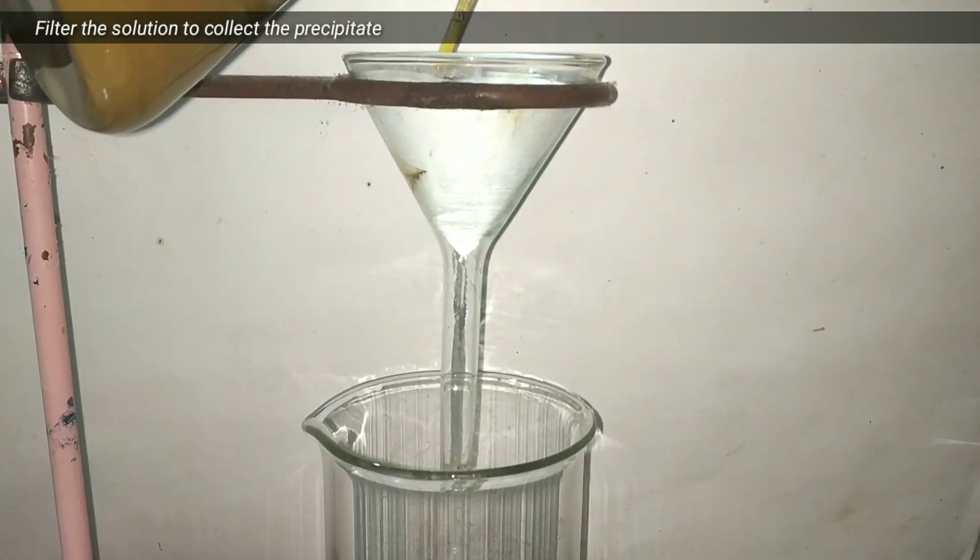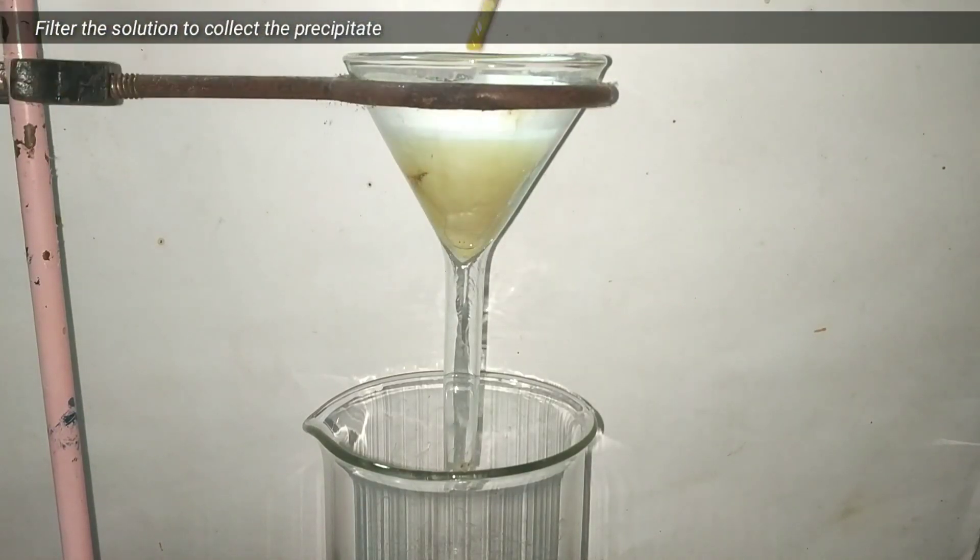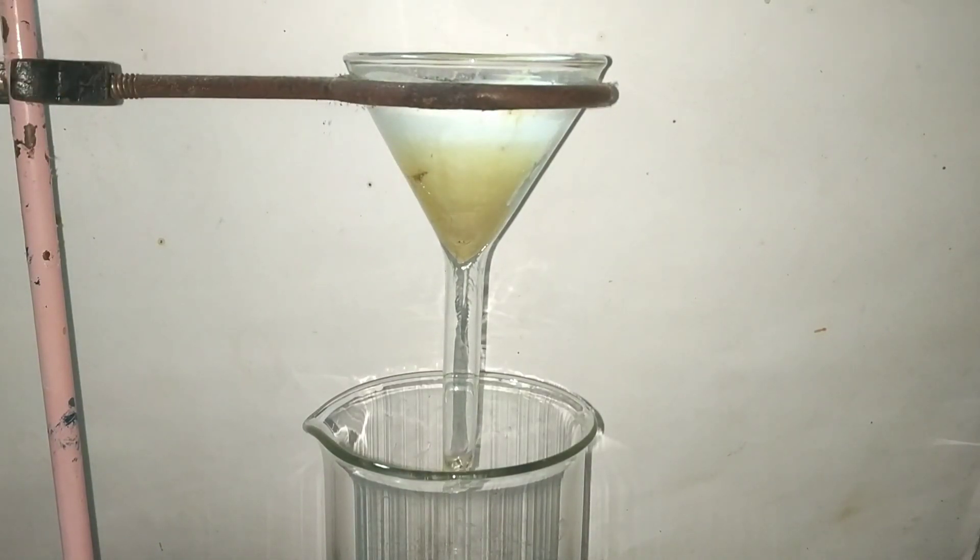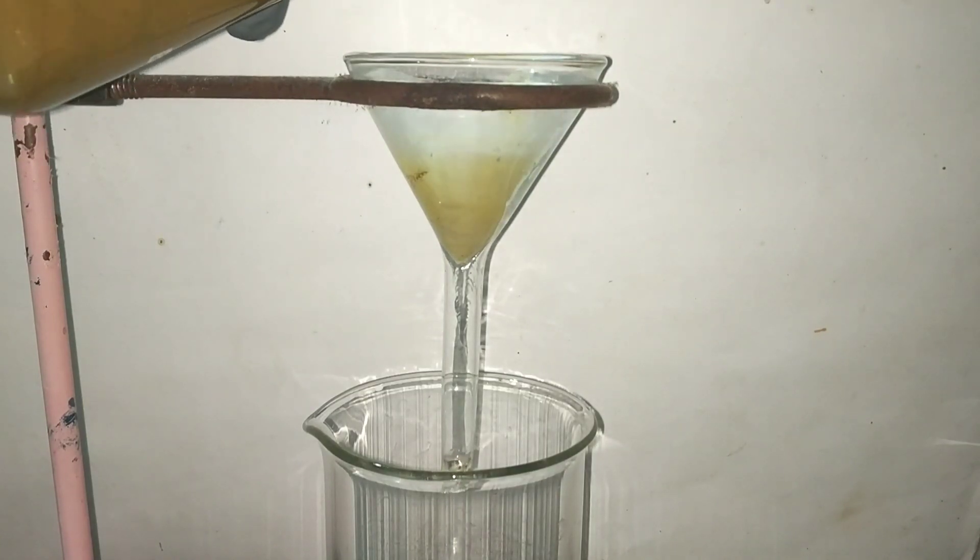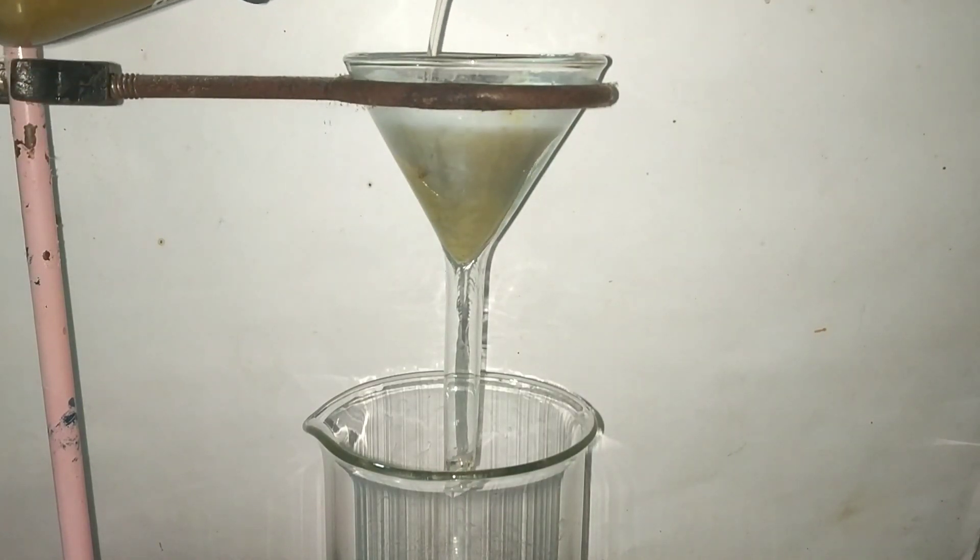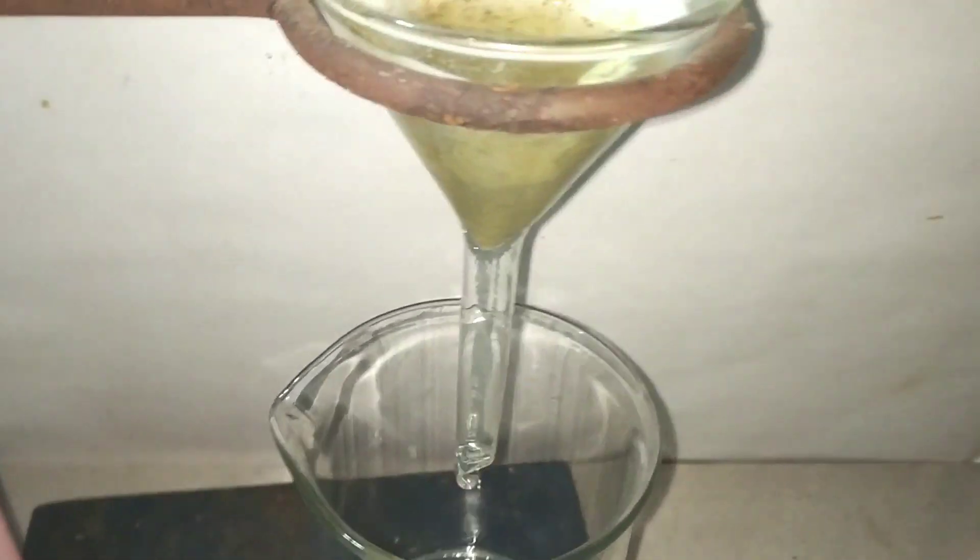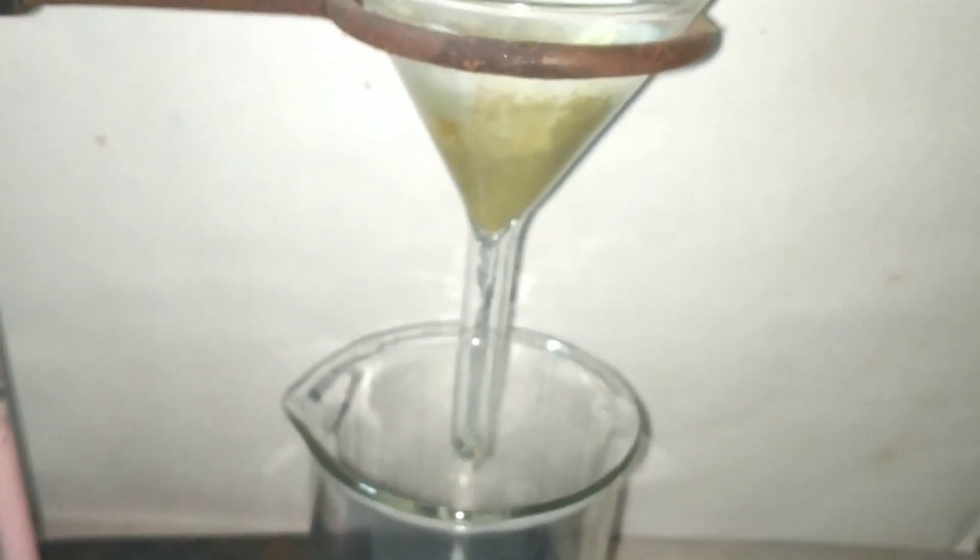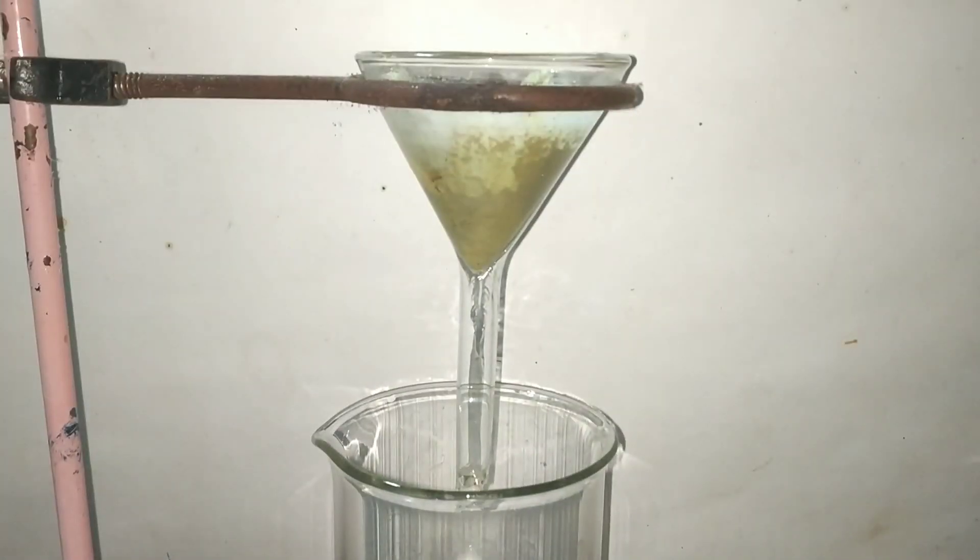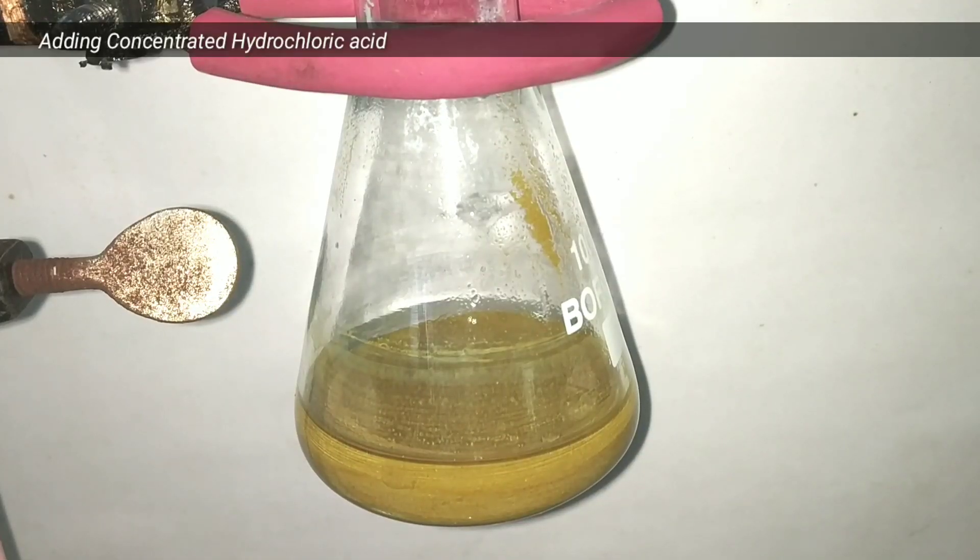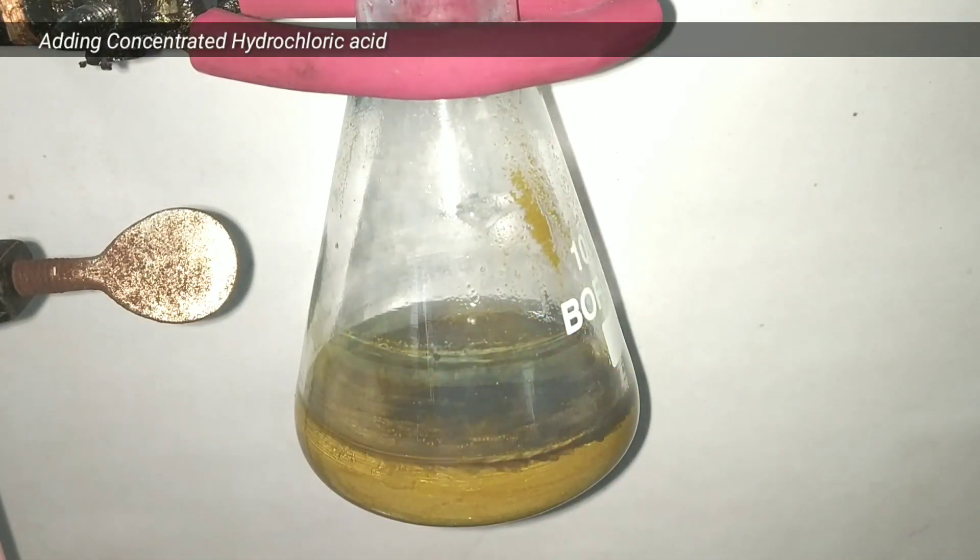We then filtered the solution to collect the precipitate which contains a mixture of mercury oxides. After the filtration step, we washed the precipitate a couple of times with distilled water to remove the excess alkali present in it.